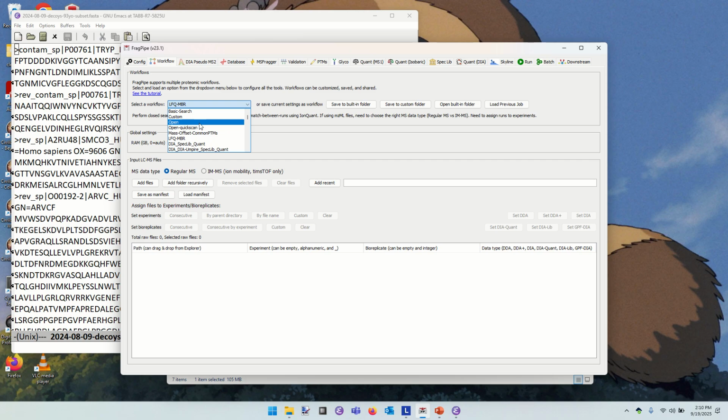So when phosphoserine kicks off phosphorylation, it may spontaneously do so in a mechanism that doesn't recreate serine. Instead, you lose water from this. You lose phosphoric acid instead of the phosphorylation. So instead of losing 80 from a phosphoserine, you could lose 98. Instead of gaining 80 to be phosphorylated, you might have minus 18 to reflect the spontaneous elimination of the phosphorylation.